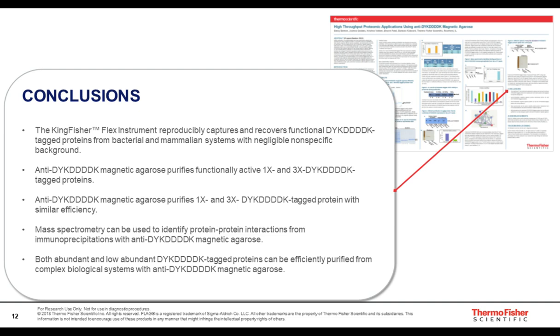Our first question is, what are the benefits of using high-capacity magnetic beads with co-IP? High-capacity beads work very well for capturing low-abundant targets. You saw that in the last figure of the presentation, figure 6. The reason for this is that due to the higher capacity, you can capture more of the available target in the lysate. We've seen higher yield in both Western blots as well as in mass spectrometry of IP lysates.